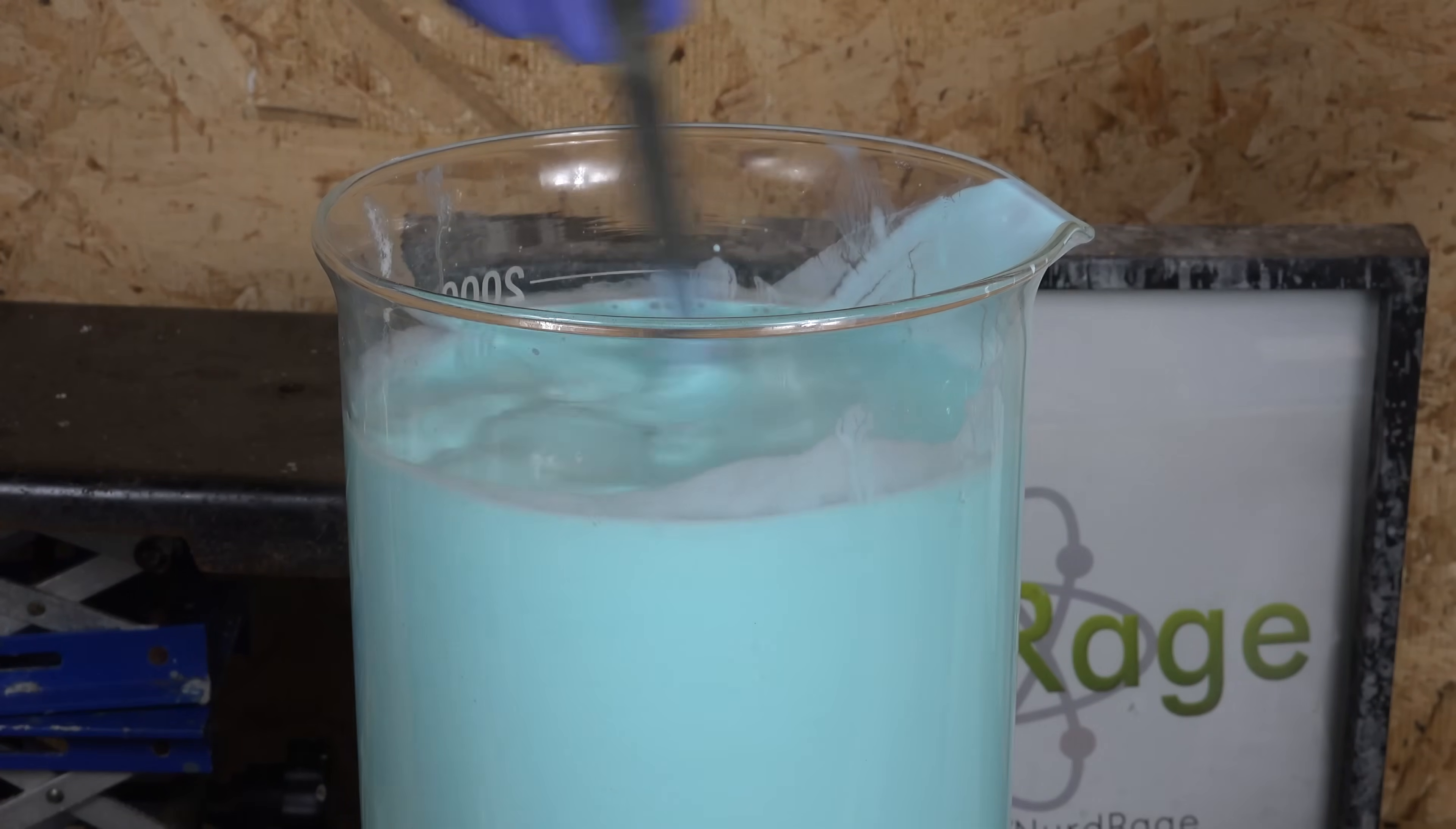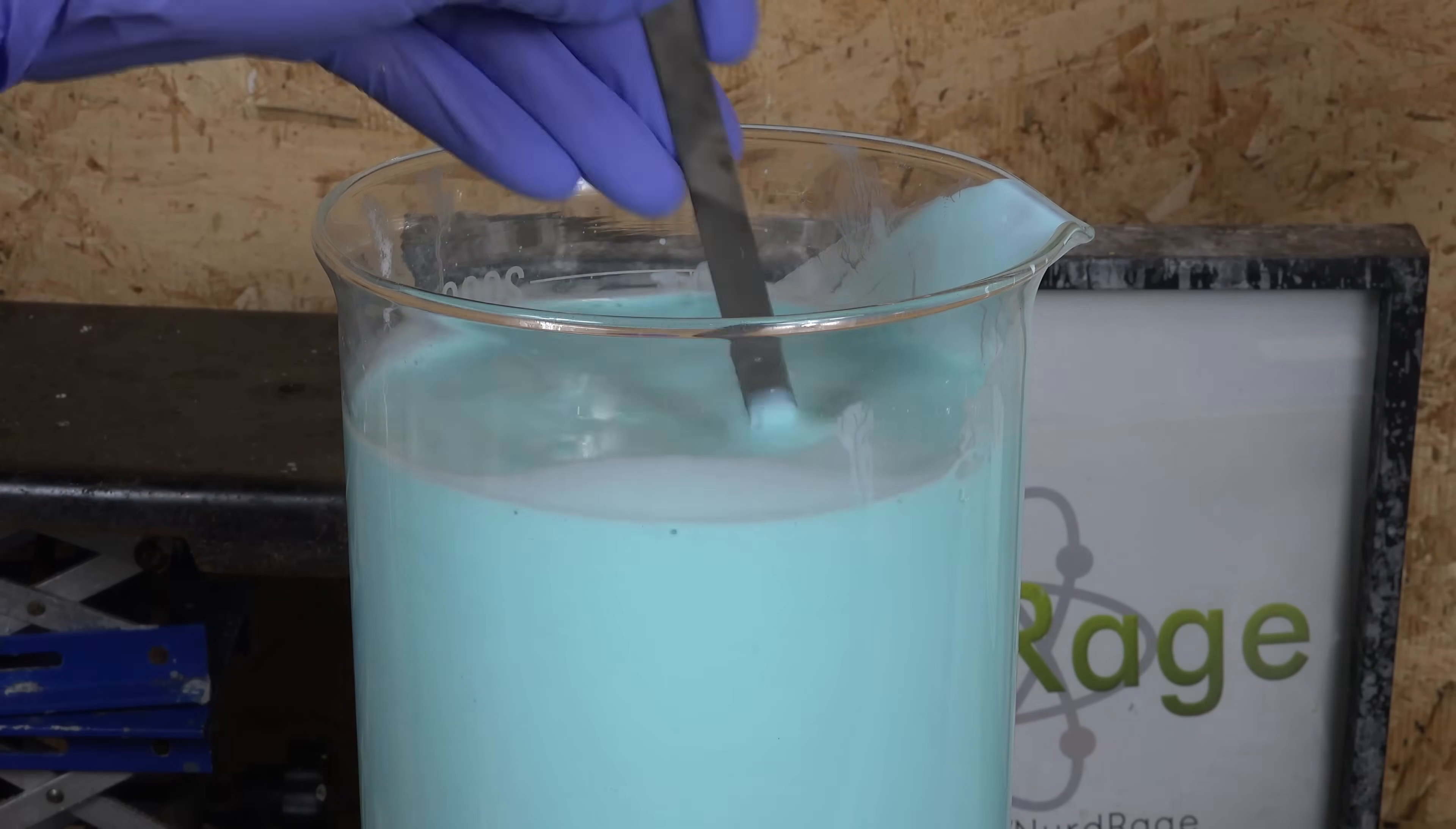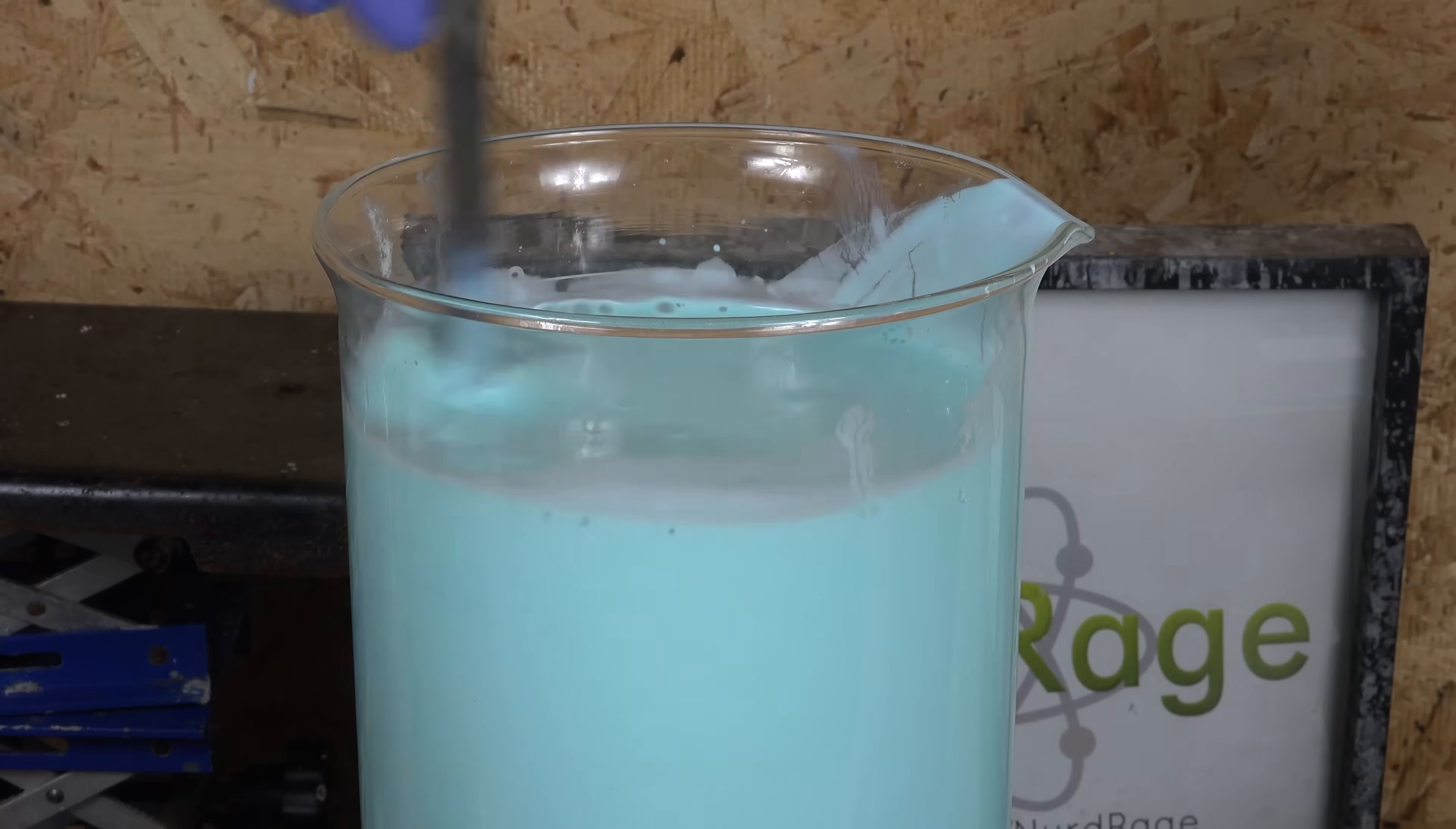This is disappointing because the process does seem to work. The minor amount of solution that did separate was almost clear, indicating the copper ions were indeed mostly removed. Without a way to separate the copper oxalate from the supernatant, it doesn't seem viable.